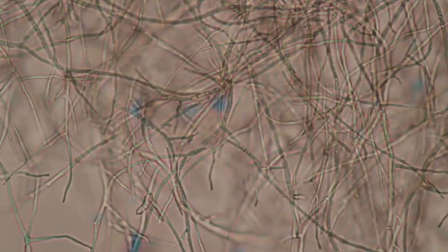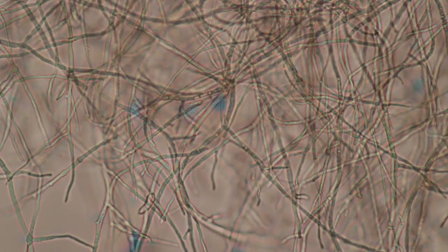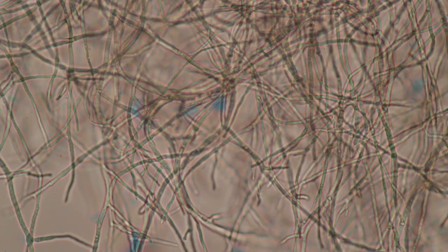Yet another higher magnification. So far I did not see any spores, but that will change. Later on I did find a lot of spores as well.